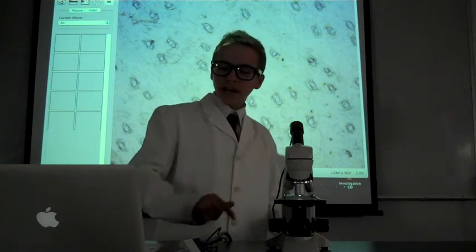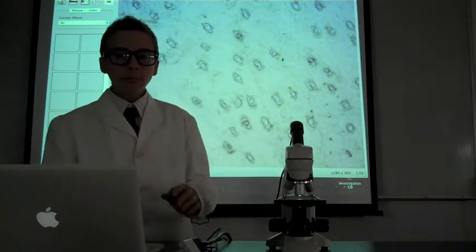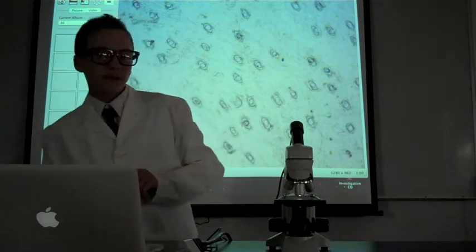For this we've got a normal microscope attached to a special piece of equipment that allows us to view it in our laptop, which I've put onto the projector behind me.